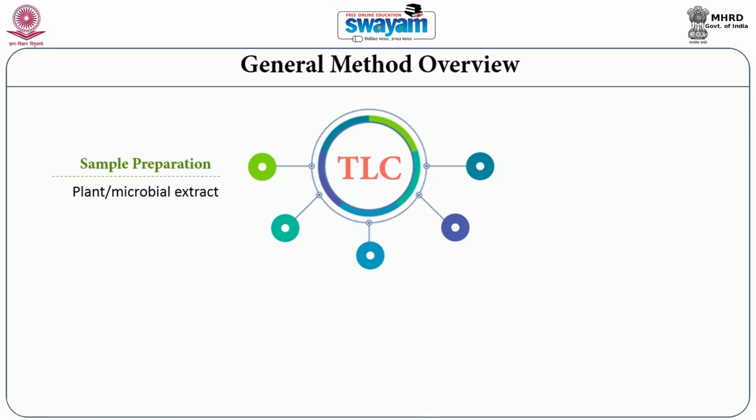Then the second step, which is important, is the plate preparation, or the selection of the kind of plate you want to use. Now, at the time that Ismailov and Schreiber and Kirschner were working, plates were being made in the lab. And even now, students starting out, say, for standardizing it in the lab, do prepare plates, but increasingly very well standardized commercial plates are available with a wide selection of stationary phases, depending upon the type of compound that you want to separate.